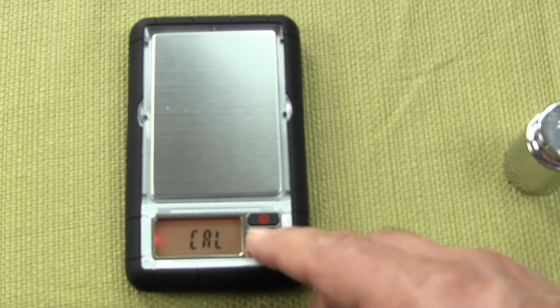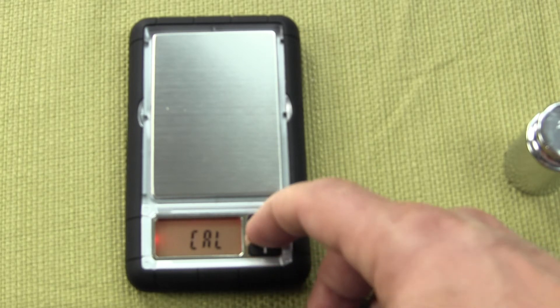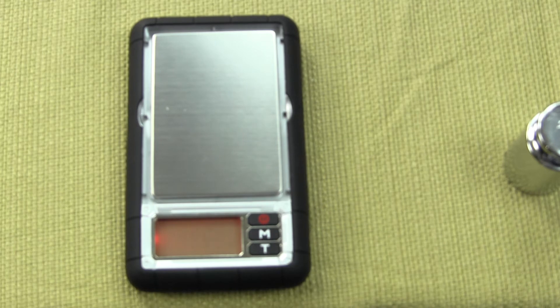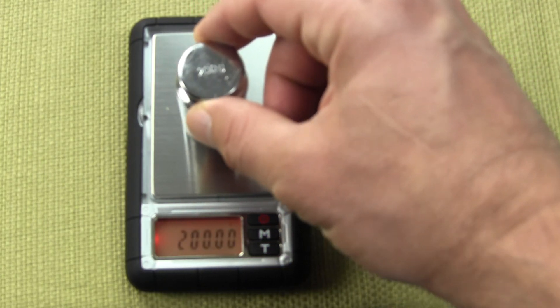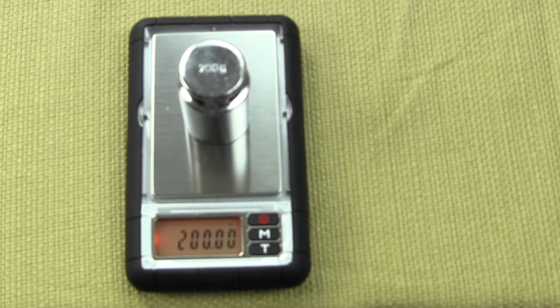Press it a second time. The scale will now flash the required calibration weight — it is a 200 gram weight. The calibration weight is an optional accessory, so you need to have your own 200 gram weight. The LCD shows "pass" and then it returns to the active weighing mode.